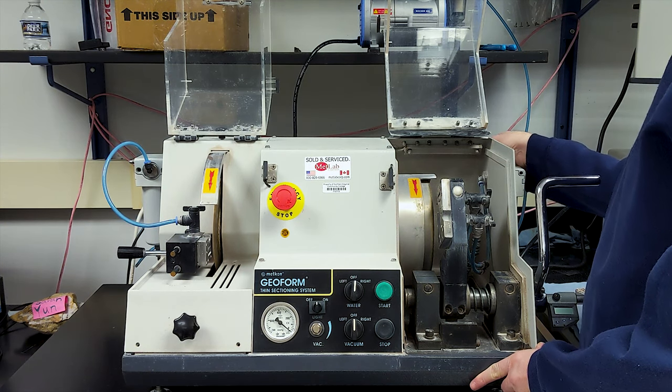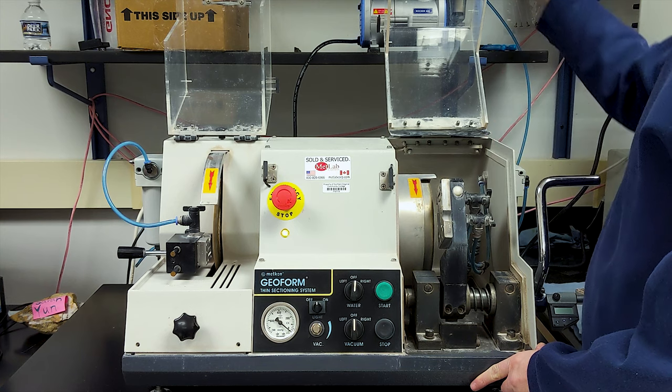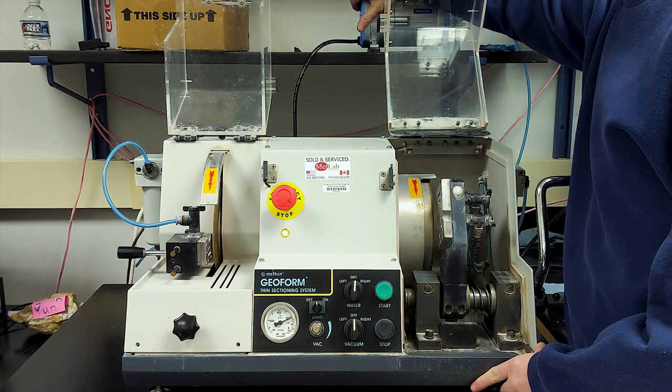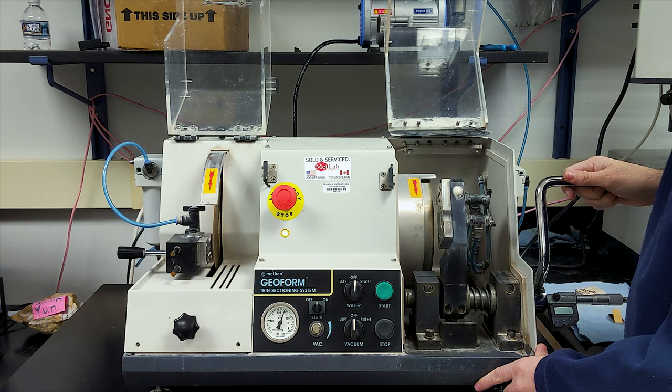To operate the GeoForm, the power switch, located along the right-hand side behind the grinding module, is flipped into the on position and the vacuum pump is also turned on.